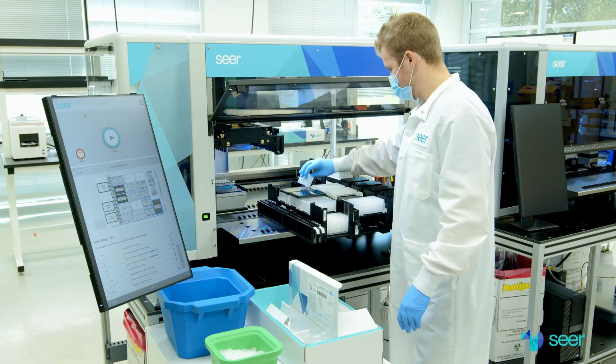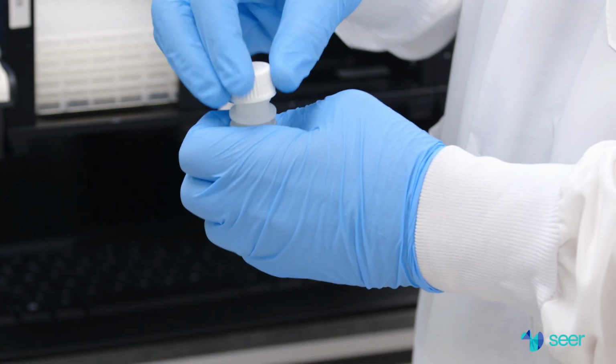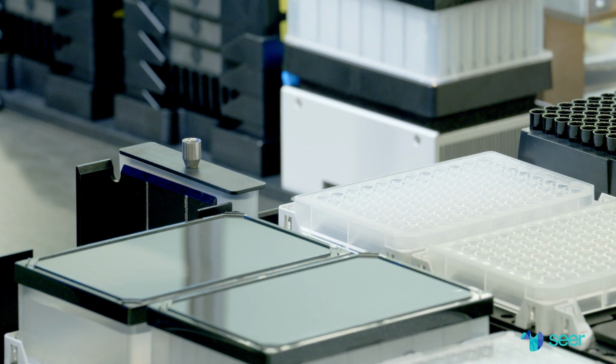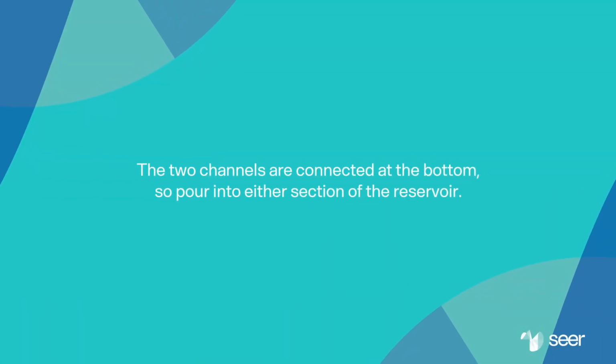Next, we will load the solutions. Follow the prompts on the ICS. Place the controlled dilution solution reservoir into position R1. Pour 1 bottle of controlled dilution solution into the reservoir and cover with a black core lid. The 2 channels are connected at the bottom, so pour into either section of the reservoir.